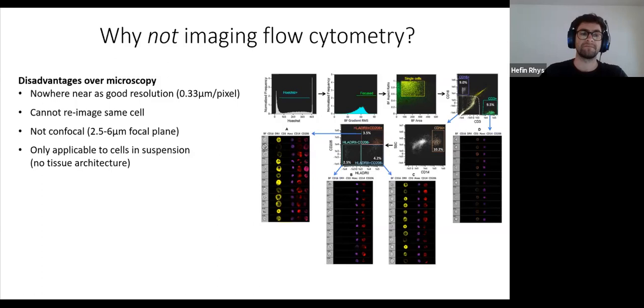using imaging flow cytometry. Of course, you can't re-image the same cell like you can in microscopy if you're doing some kind of time lapse or looking at how some process changes over time.